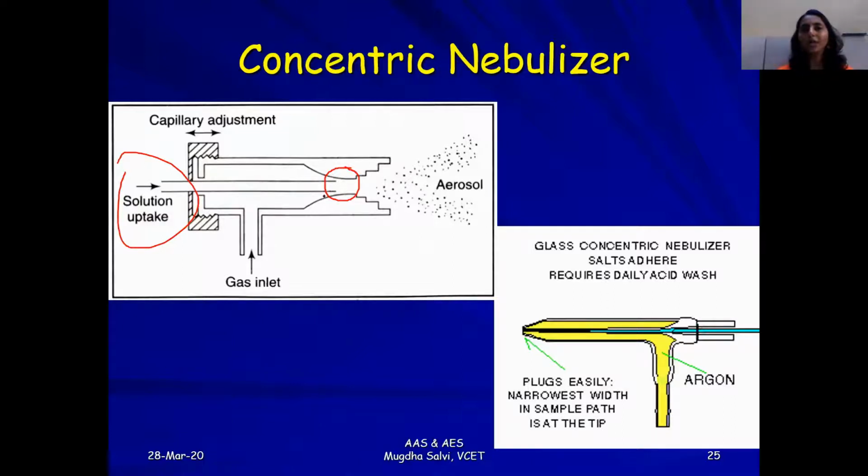So both are trying to come out through the same small space. And when they do, due to the force of the gas inlet, the solution is pressurized and split into very fine particles, which is nothing but aerosol. That is what happens in any nebulizer that you take.